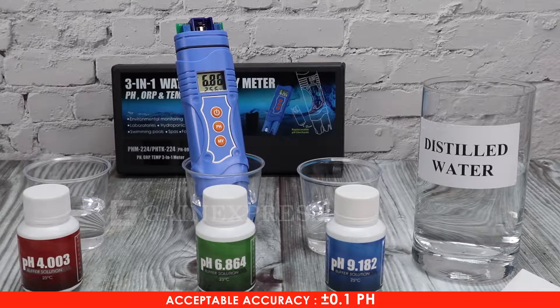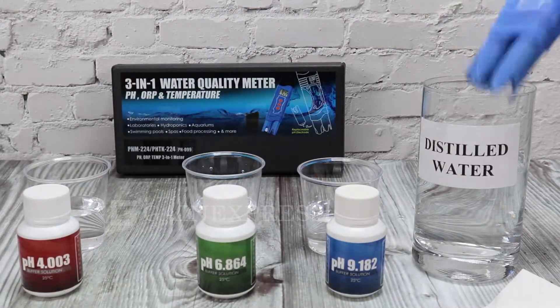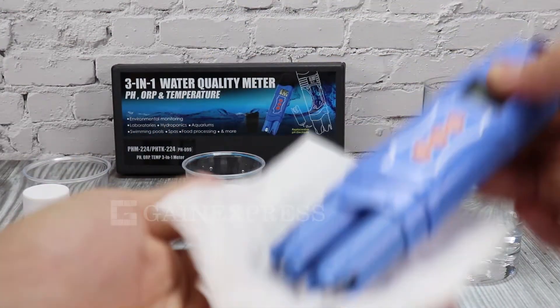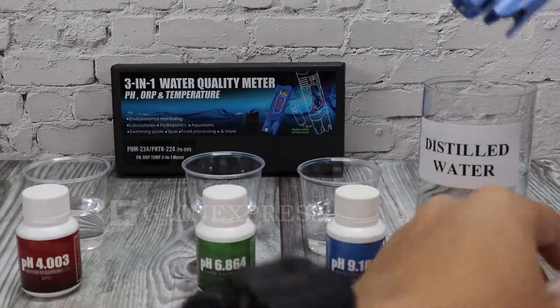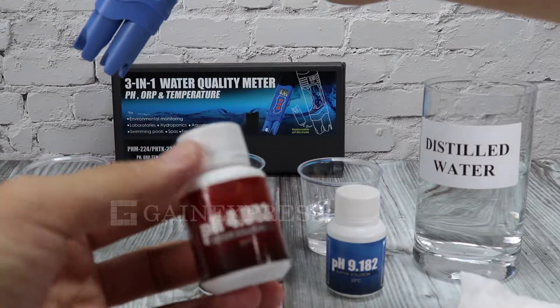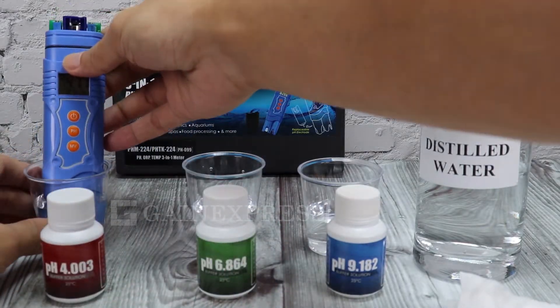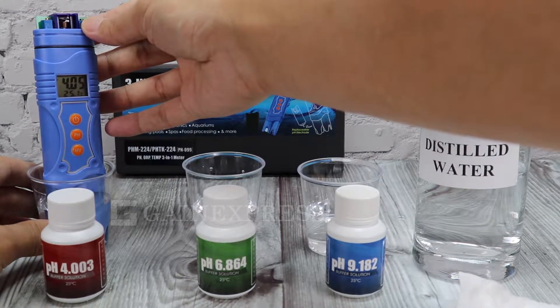If the display value is within the accuracy range, it is acceptable. Rinse again the meter with distilled water before trying the pH 4.0 buffer solution. If the display value is within the accuracy range, it is acceptable.